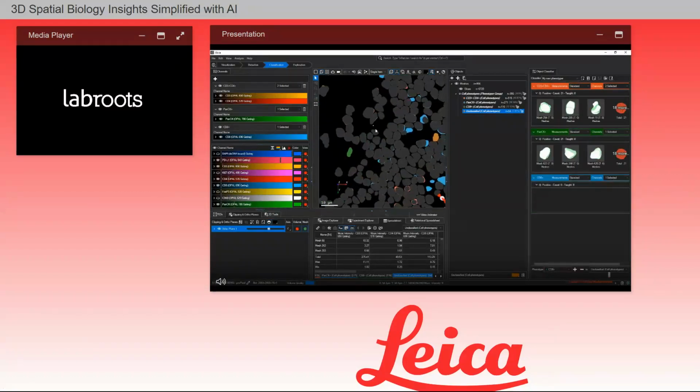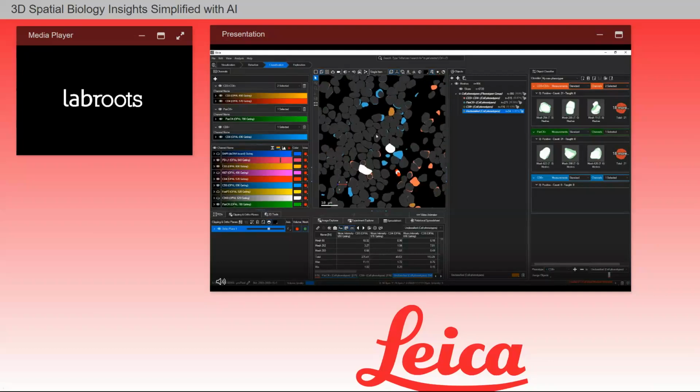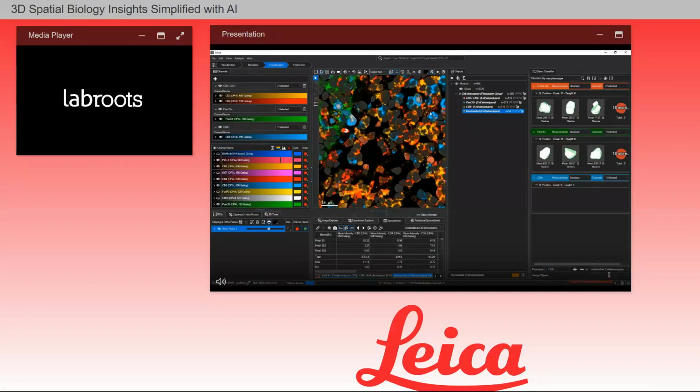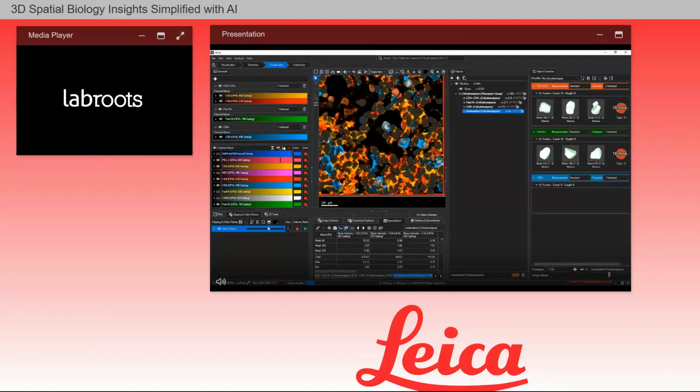Let's finish with training the CD8 positive class. You can use the random forest classifier that the phenotyper creates on another data set in the future. Besides right-click, I can also assign the objects by going to the Assign Objects button at the bottom of the object classifier. Let's select the meshes object set to train and apply the classifier.